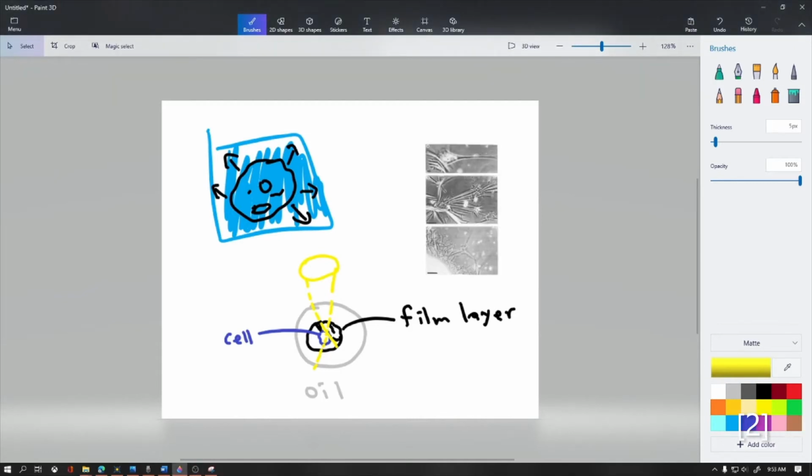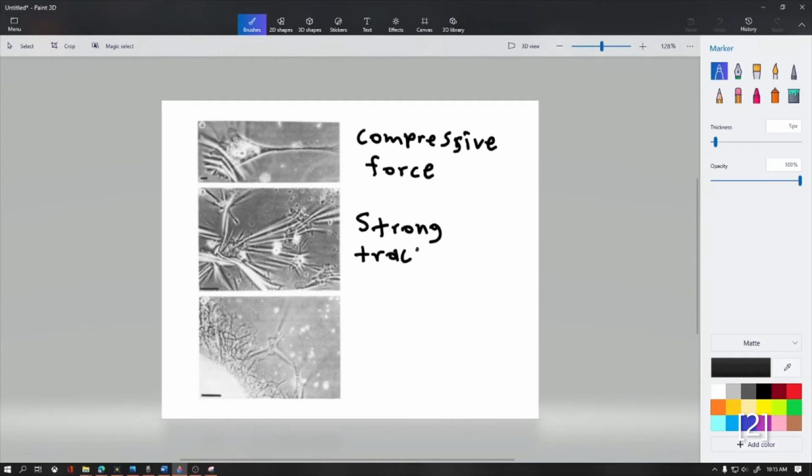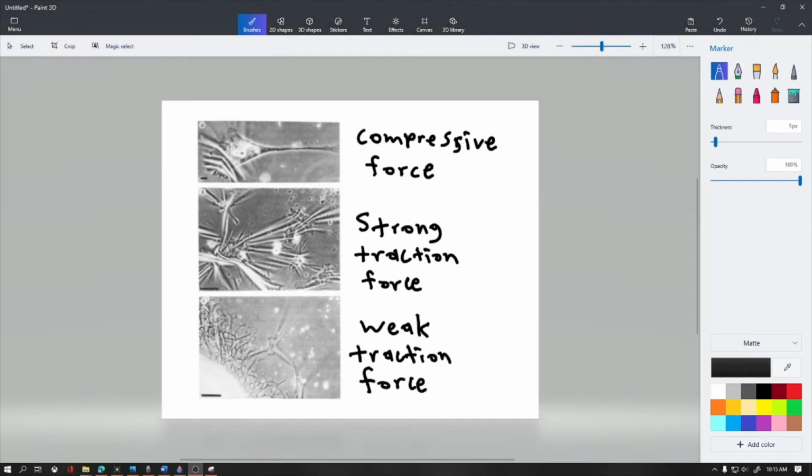But even early on, before more quantitative methods were developed, this method could tell you quite a bit about different cell behaviors and relative strengths, say showing the difference in cell forces between a muscle cell and a leukocyte. But there's a lot of difficulty in trying to discern the precise forces and displacements in this method simply from looking at a couple of wrinkles. After all, some of these wrinkles are so much larger than the cell that it's really hard to tell what's even going on.